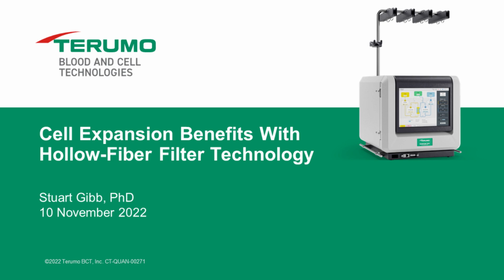Thank you very much, Alex. It's a pleasure to talk to you this morning. I'm going to be talking to you about the cell expansion benefits of using hollow fibers.